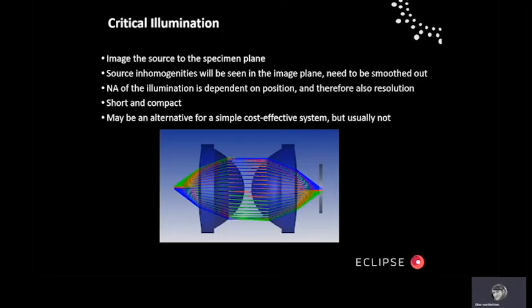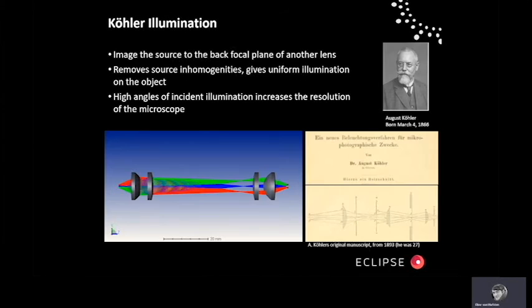And another problem with this is that your NA of the illumination will be dependent on where you are in the specimen, and therefore also the resolution. But this system is short and compact, which is maybe the only good thing. So this is usually not recommended.